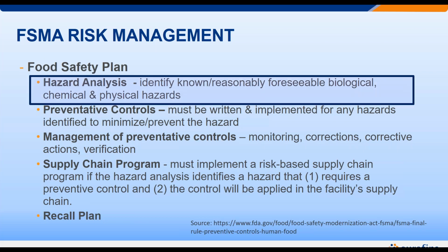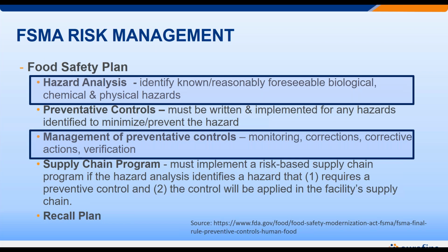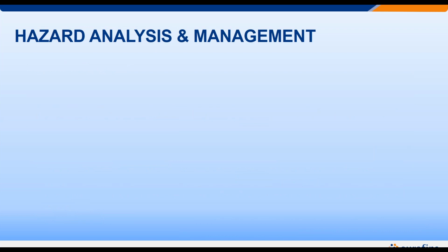Today, two of the components that we're going to focus on, and how that integrates into building a risk management program and using risk screening tools, are looking at our hazard analysis. So how can we identify these microbial hazards, in our case, because we're going to talk about microbial risk for our food process or our environment. And then what are the tools to actually monitor and prove that we're doing that efficiently? Those are the two big components of our food safety plan required by FSMA that we're going to talk about today. All right, so kicking off with the hazard analysis and management.